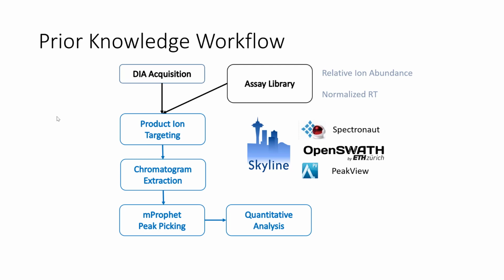The only other real way of building an assay library comes out of the Transproteomic Pipeline, which is a project that Rudi Aebersold started. The ETH group, this open source group, uses this route. This is certainly the route that they were teaching at the ETH DIA course, and it's the route that they used to build the Pan-Human Library, which is to run it through a tool called SpectraST. It's part of the Transproteomic Pipeline. And then actually Spectronaut obviously can build its own assay library.